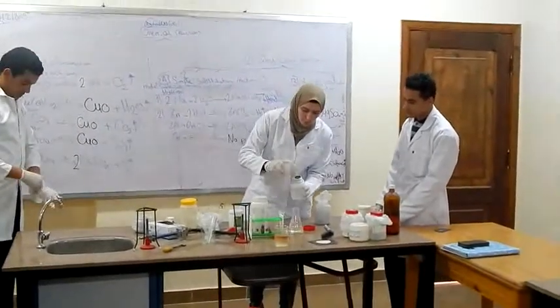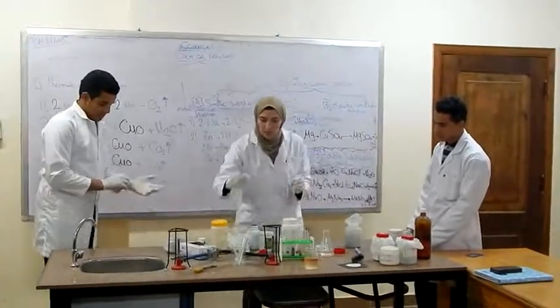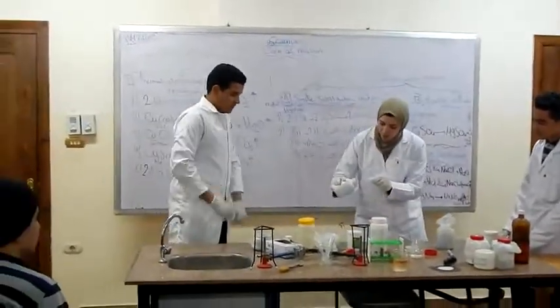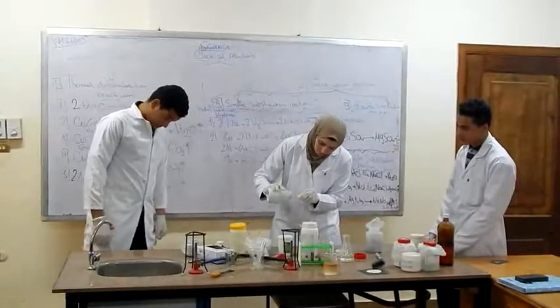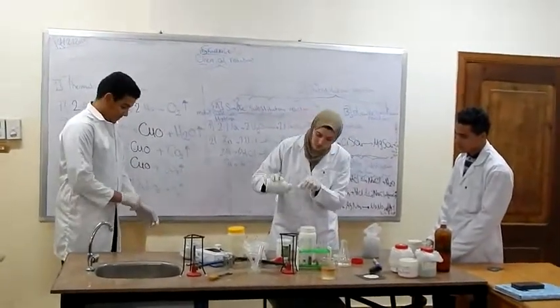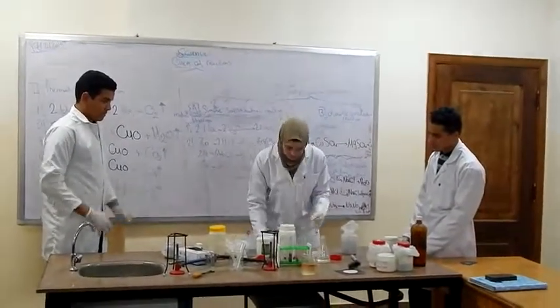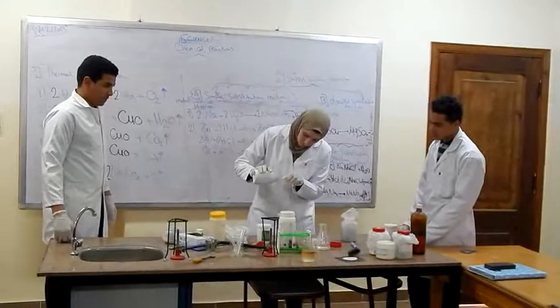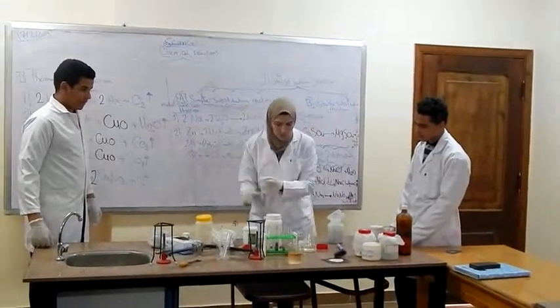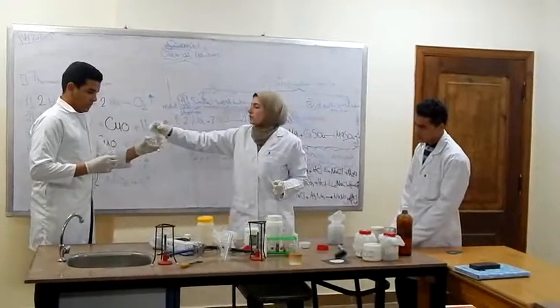Now see the reaction between copper metal and diluted hydrochloric acid.